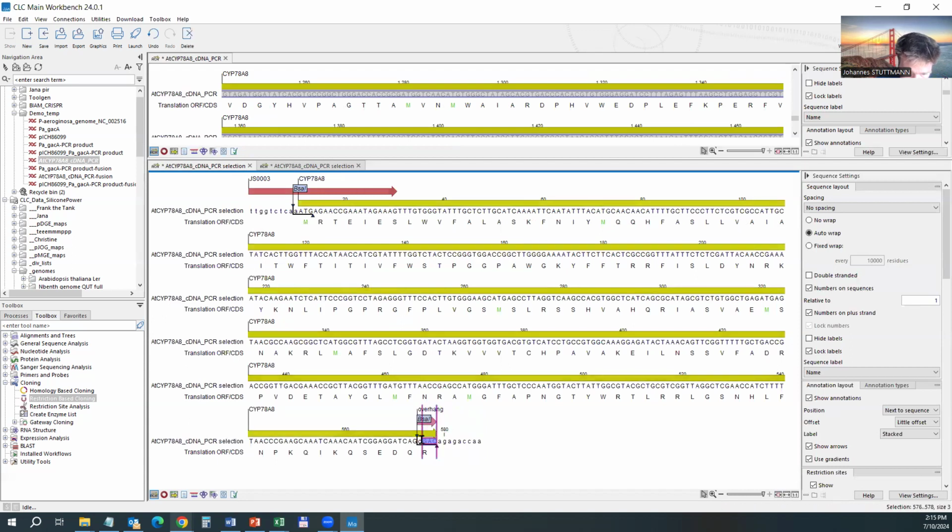The thing is that I do have now also this adapter here, so I have a mismatch here theoretically. This base is not present in the template when I start doing PCR. So now for having something that nicely hybridizes, I would make my calculation with this part. And since there are many ATs, we could maybe make it until here.